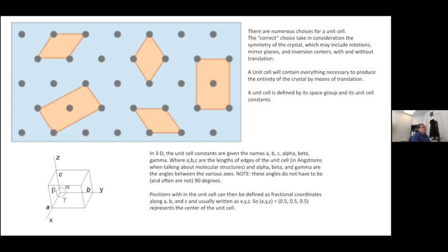So the most common one we see is matching up a rotation with a translation, and we call that a screw axis. So the way a screw axis works is you take the contents of your unit cell, rotate it by a certain amount, and then translate it by a certain amount in a specific direction. And that will overlap the contents, so the original contents overlap with the new area that it's reached. Okay.